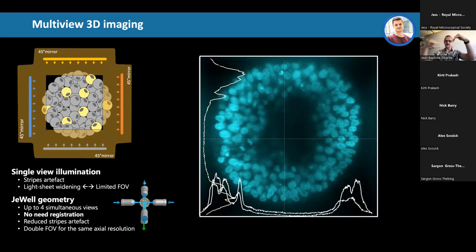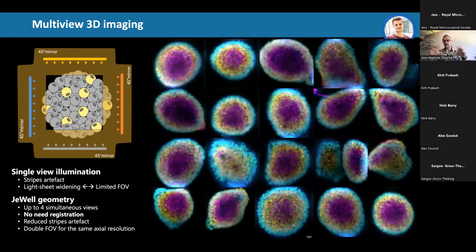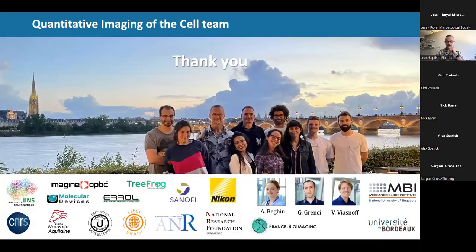Because when you shine from one objective to another and you change which one is illuminating and which one is looking at, then the planes of imaging are not the same. In our case, it's much easier because the camera does not move and the sample does not move; we are just changing the light sheet and exciting from the different sides. Now we have a more isotropic system in 3D, compatible, of course, with high content screening. So that's another thing, a bit ongoing.